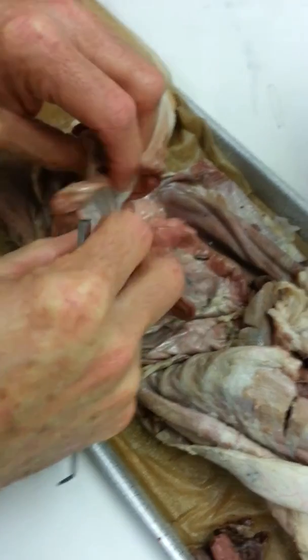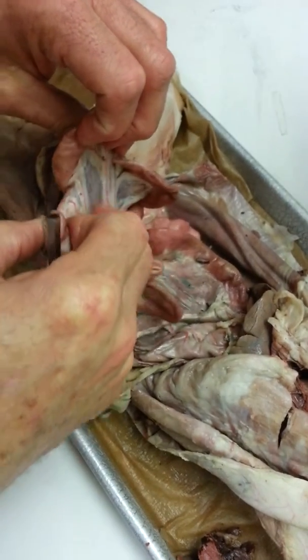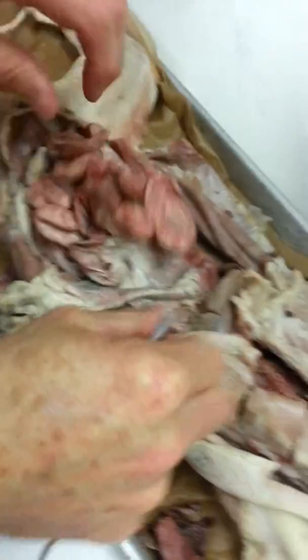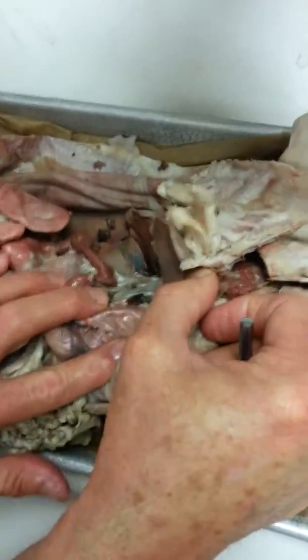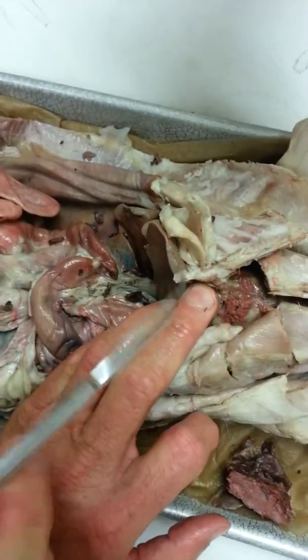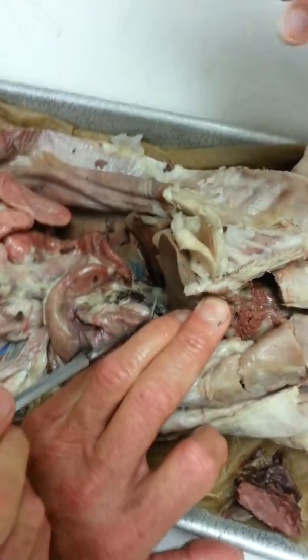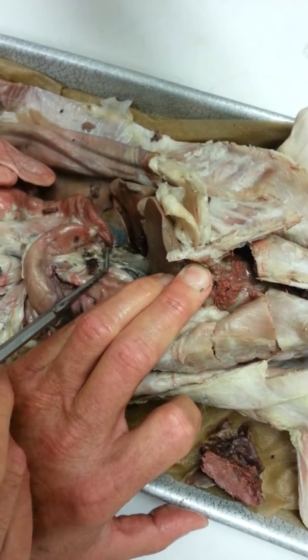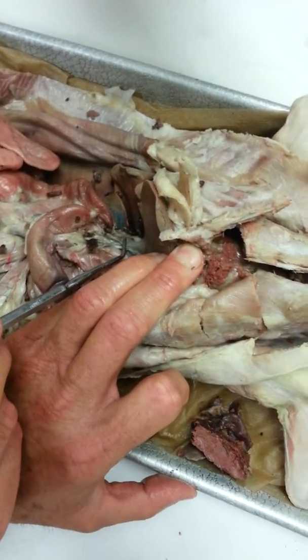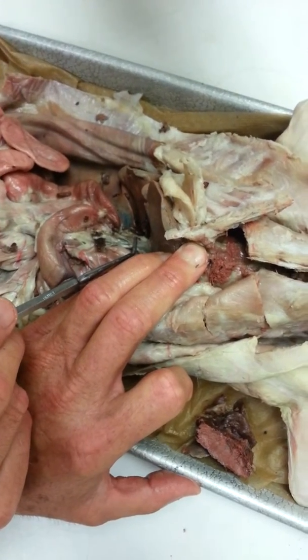The material right here, mesentery, between the lobes of the small intestine. And down here, I guess I should go back here real quick. All the material right here is called lesser omentum. It's this little bit of connective tissue in here. It's all called lesser omentum. And what that does, it surrounds the cystic duct and the hepatic duct to protect them.